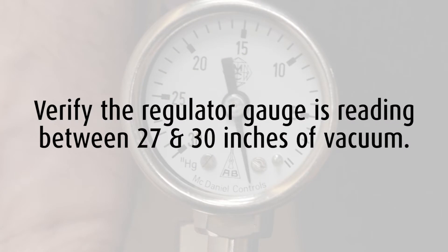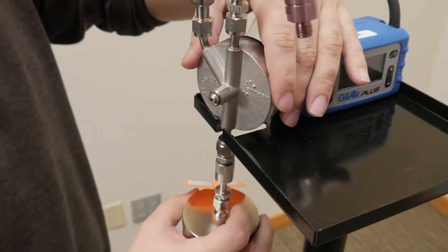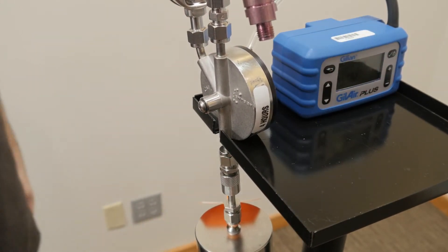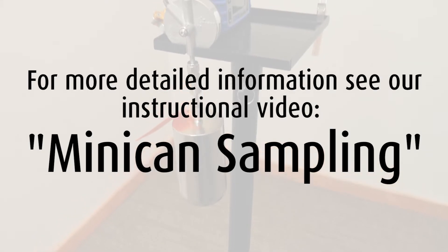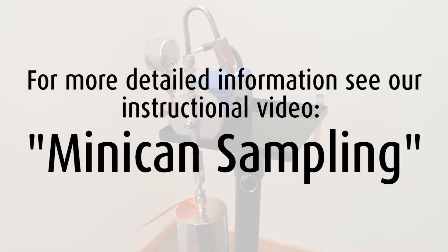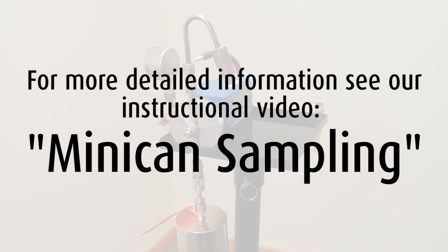Verify the regulator gauge is reading between 27 and 30 inches of vacuum. This vacuum will slowly decrease while sampling at variable rates. Holding the regulator and MiniCan at an angle, slide them onto the tray at the bottom of the regulator. For more detailed instructions, see our instructional video, MiniCan Sampling.